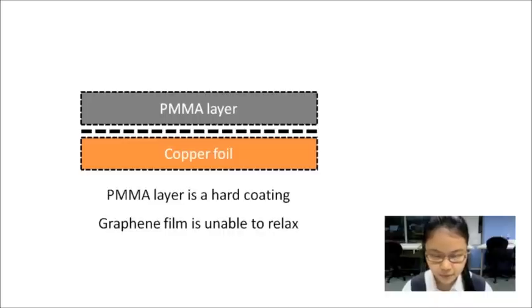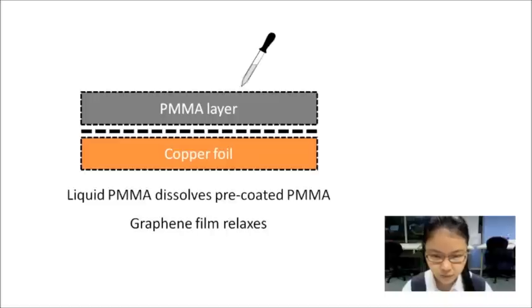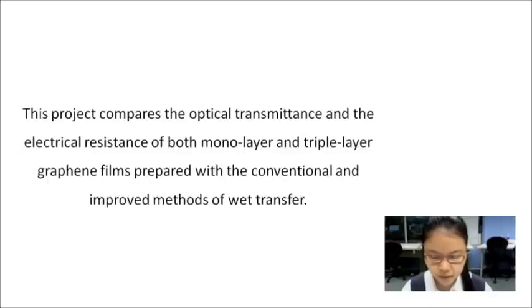The main problem is that the PMMA layer is a hard coating, and the adhered graphene film is unable to relax even when the PMMA is removed. The transfer method can be improved by introducing a second PMMA coating because the liquid PMMA solution can dissolve the pre-coated PMMA layer to relax the graphene film. This project compares the optical transmittance and electrical resistance of both monolayer and triple-layer graphene films prepared with the conventional and improved methods.